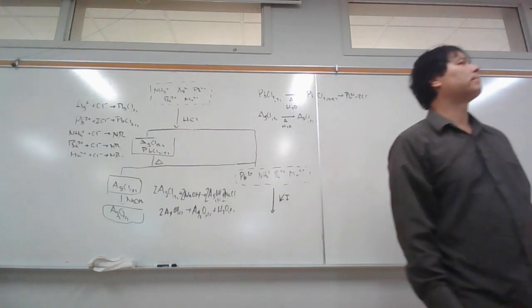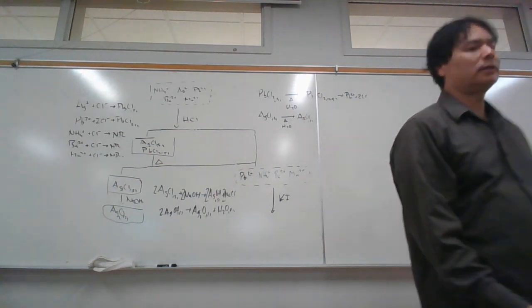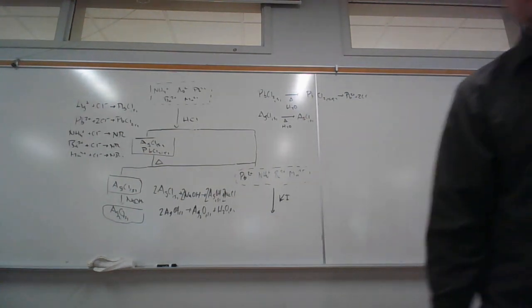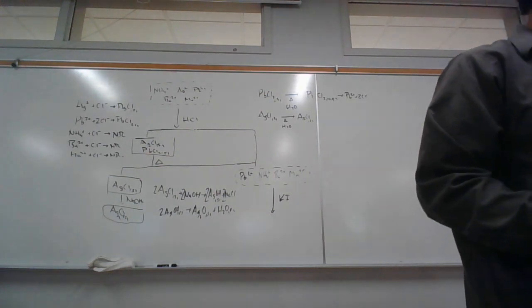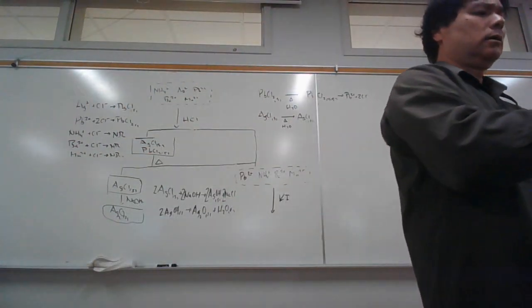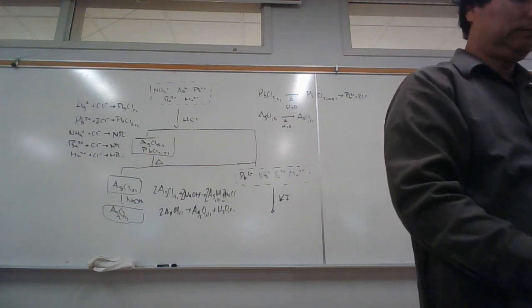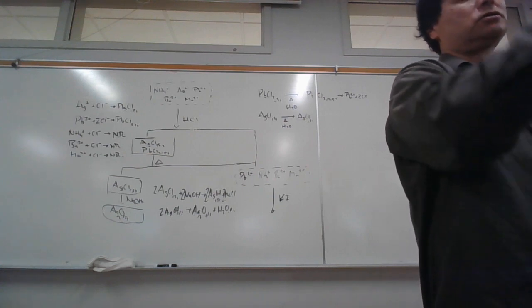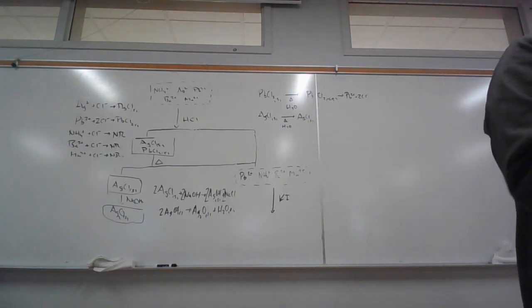Do we have hot plates in here? I might get some hot plates. Let's see if there are hot plates available. If not, unfortunately, we'll have to heat it up on the burner. We'll have to heat it up in a hot water bath. If there's no hot plate, then what you want to do is you want to set up a hot water bath immediately. This is the first step that you'll do. You don't want to use the biggest beaker for your hot water bath because sometimes we have to use a small test tube. So sizing it up, this is probably good here. Like a 250 or 150. 250 or 150 would work well. And then we'll set up a hot water bath here so you can have your solution.